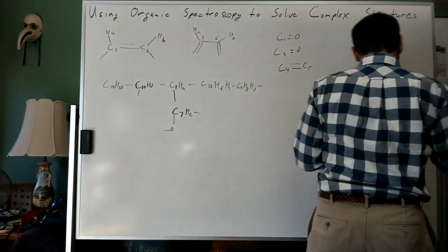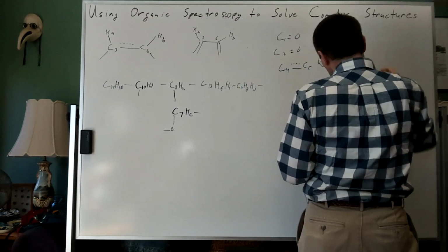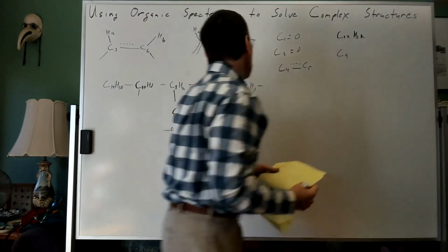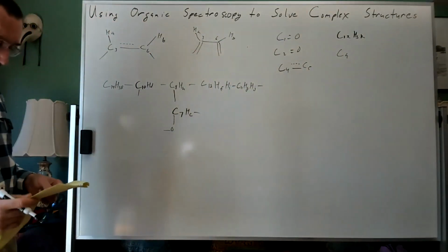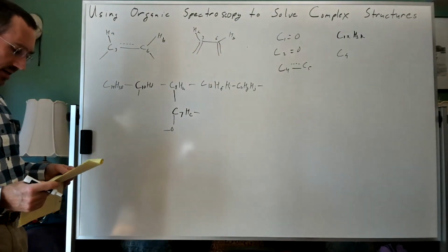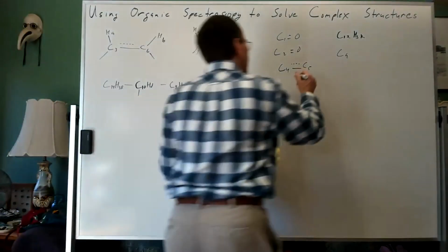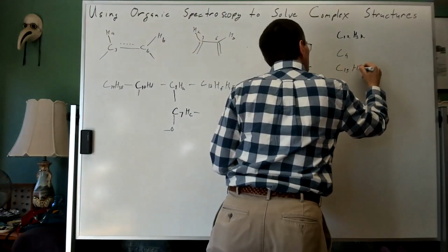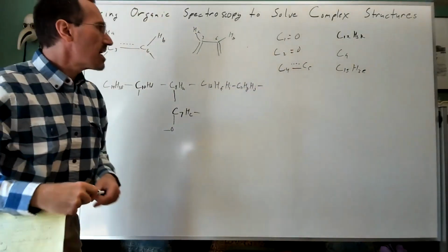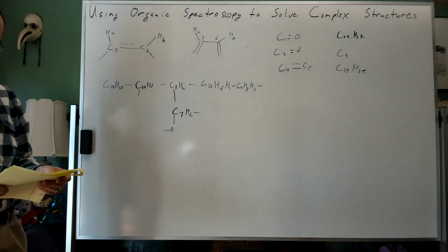So I'm just sort of suspecting that C12, H3K, that isolated methyl, and C9 are quats. And I guess the other thing I think we still have is C15, C15 H3E, that methyl with that allylic type of coupling. Thoughts or questions at this point?